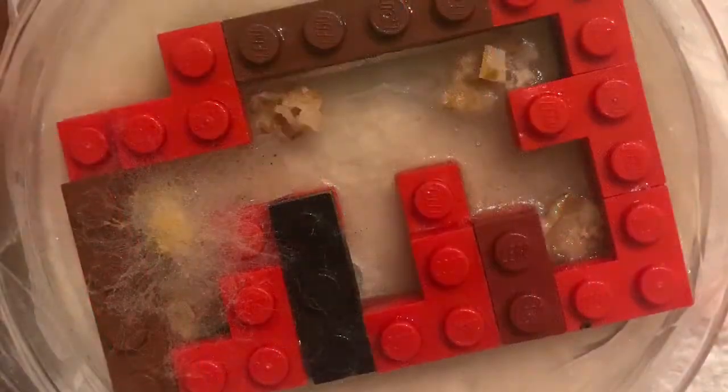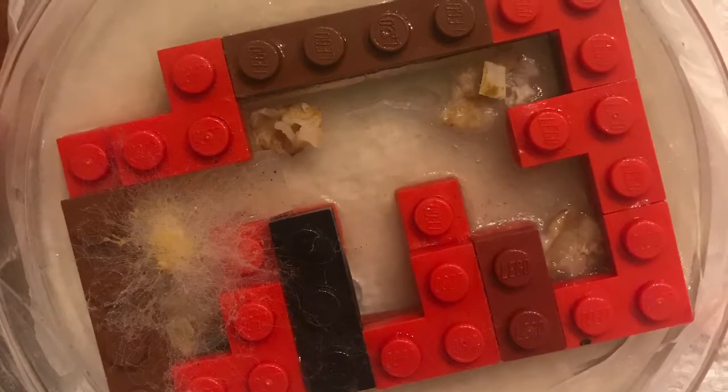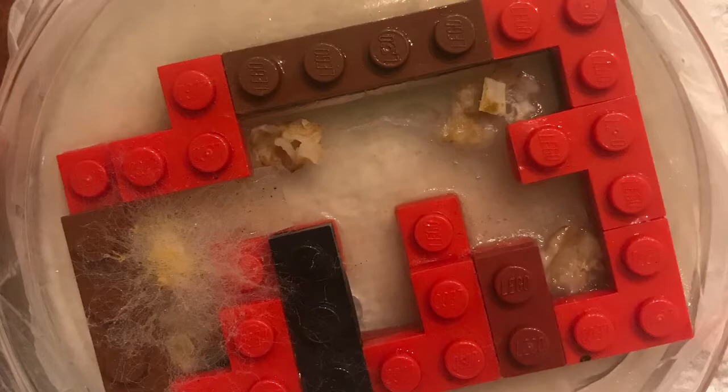We did, however, attempt to transplant a partially grown slime mold after the experiment. As you can see, a different mold grew along with a small slime mold. This may have been due to human errors such as breath or incorrect sterilization procedures.